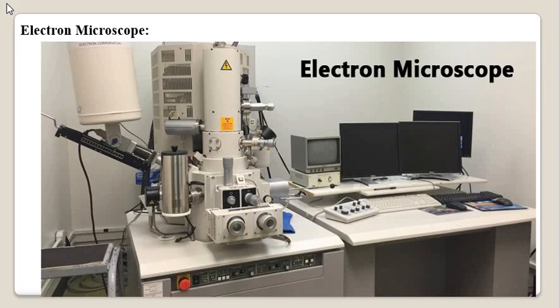In the light microscope, or the compound microscope, visible light is used as a source of illumination, right? In the electron microscope, what is used as a source of illumination? Electrons. Yes. In a light microscope, the source of illumination is at the bottom, whereas in the electron microscope, the source of illumination is at the top, right?